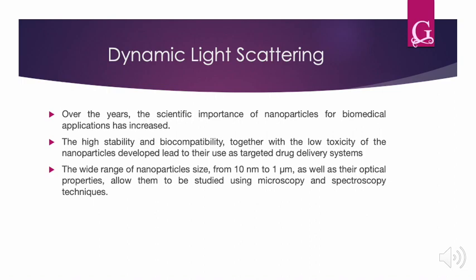وبالإضافة لموضوع كثير مهم بالنسبة للنانو بارتيكل size. A range of nanoparticle size from 10 nanometer to 1 micrometer, as well as their optical properties, allow them to be studied using microscopy and spectroscopy techniques.